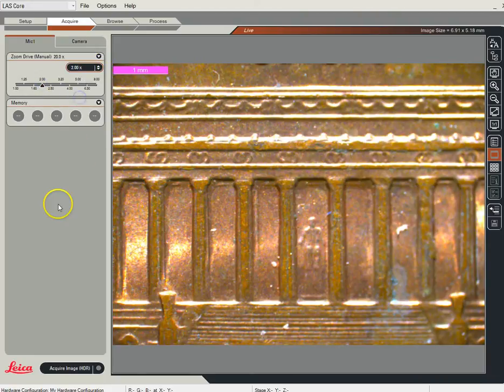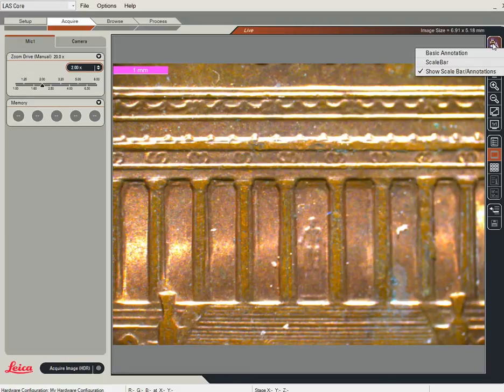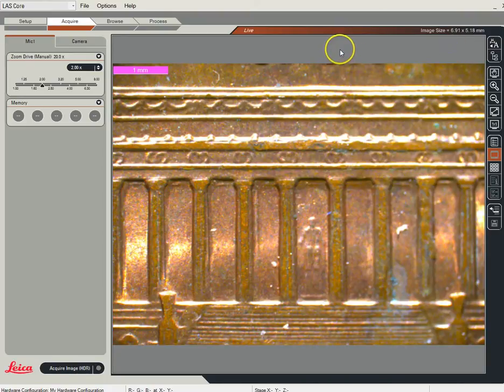The easiest way is just to come in like this. That scale bar, we got that by clicking on this annotation option. If you end up taking a picture and that scale bar doesn't end up on your picture, you have to come under here and tell it you want the scale bar, you want it to show, and you want it merged — and that should take care of that.